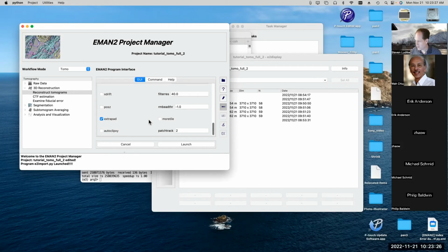So I guess what I'm saying is you won't get identical looking tomograms, but the good regions of the tomogram should be every bit as good in an EMAN reconstruction as an IMOD reconstruction. Now, there are other things you need to consider about how you're going to filter the tomograms and stuff like that for best visualization.